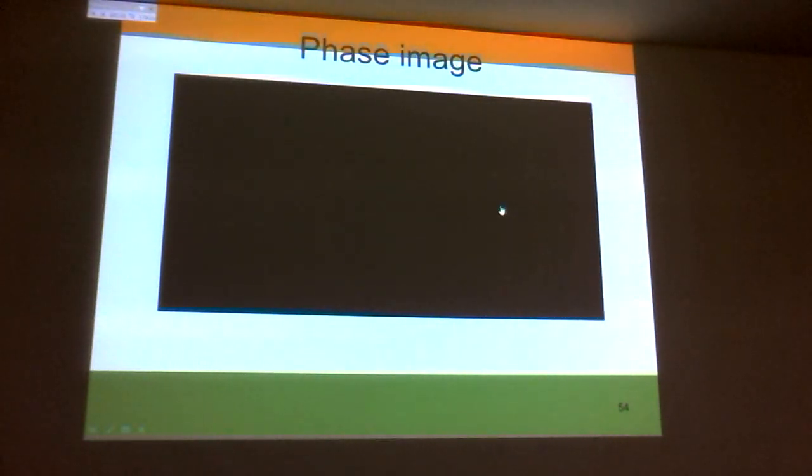Yeah, so you know that you're picking out a slice which may be 300 plus or minus 20 or 30. That's right. But you have an ambiguity of where that depth is. If I go across the cross-section of the image, it may not actually be a slice, right? It may be something that's wandering. Yeah, it's different slices going all the way. No, this is a constant time. So if it's a constant time, and there's any change in the material characteristics as I go across, it's going to be a different depth, right?